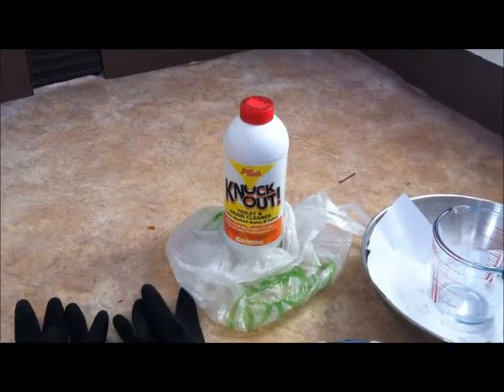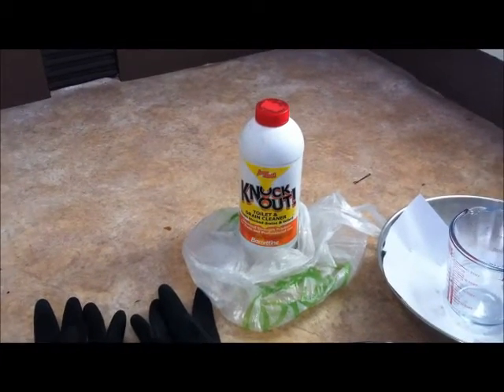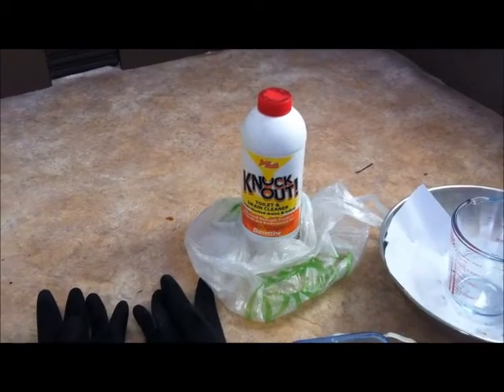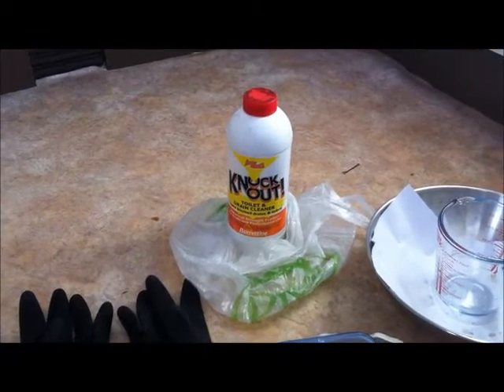In this video I'm going to talk about the dangers of using sulfuric acid for amateur home chemistry experiments. Amateur home chemistry is something I'm quite interested in myself and I know there's a lot of YouTube users that like to do this kind of stuff.